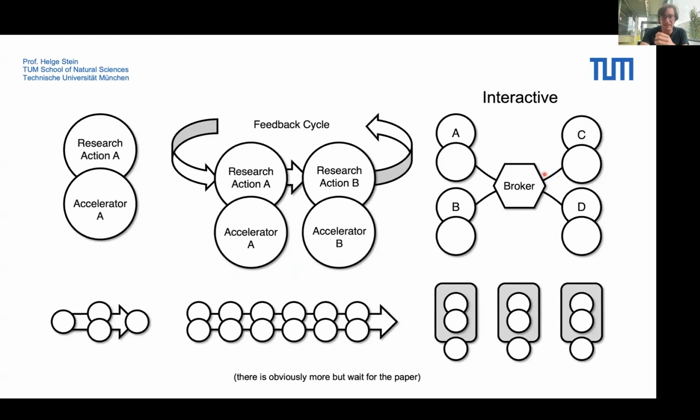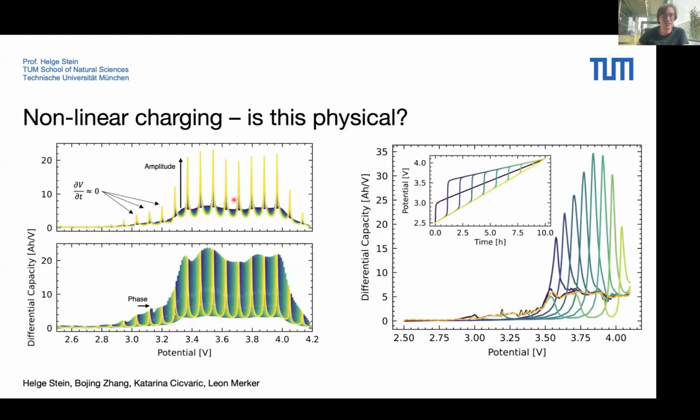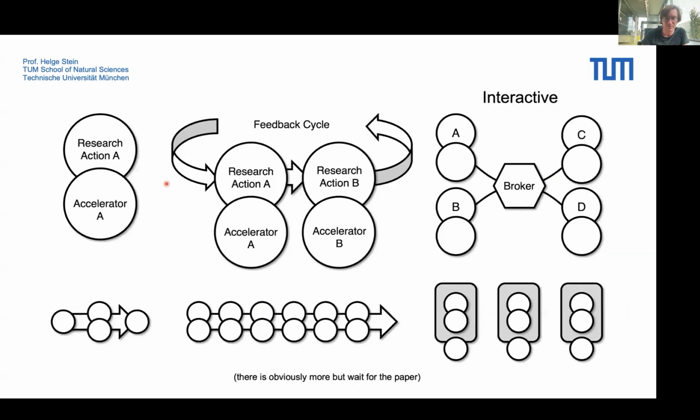But what you can in the end do is a nonlinear charging and, let's say, test the limits of some of the analysis techniques that you have in battery research. This is maybe a little bit unphysical, but at least a fun exercise to do. And I would invite you to read the paper if you're interested in this.